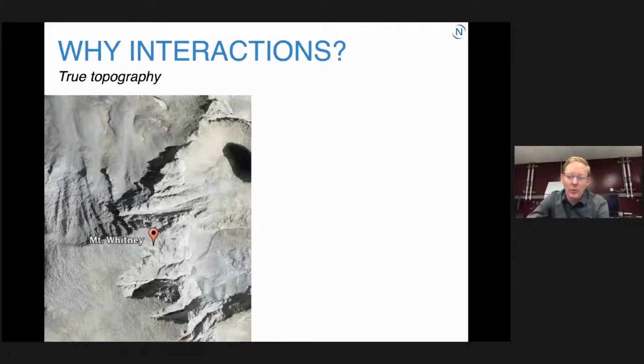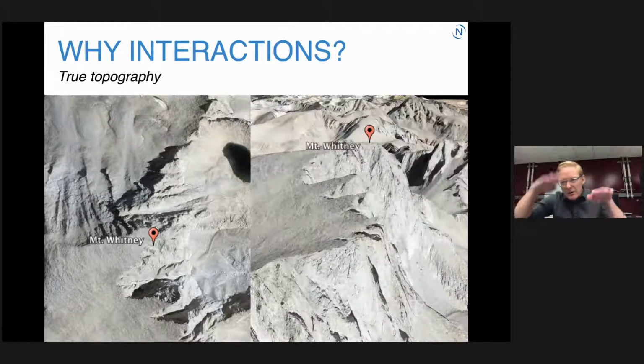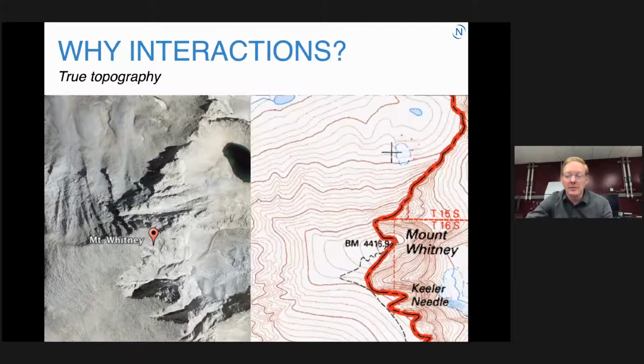So I mentioned before, a few minutes ago, tomography, where you can look at tilt. If you wanted to understand the topography of this mountain range, you can look down at it out the window of your airplane and see the topography. You could go down a little bit and look out at the side and get a sense of that topography. But if you really want to know the topography and it really matters, you probably have to, at least in years past, walk through that mountain range and generate a topographic map.